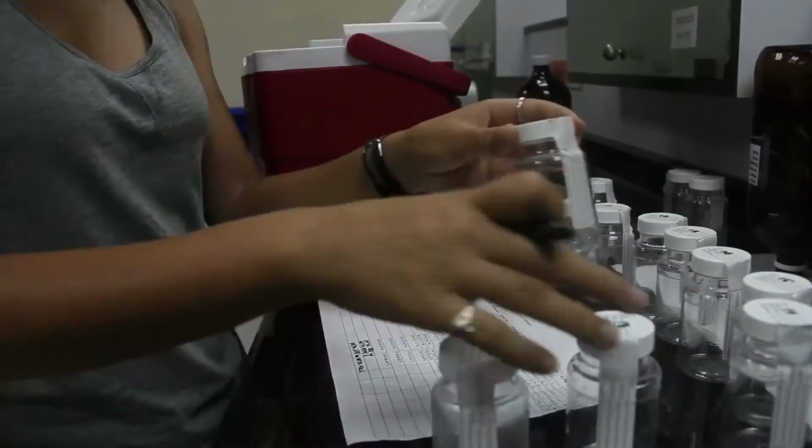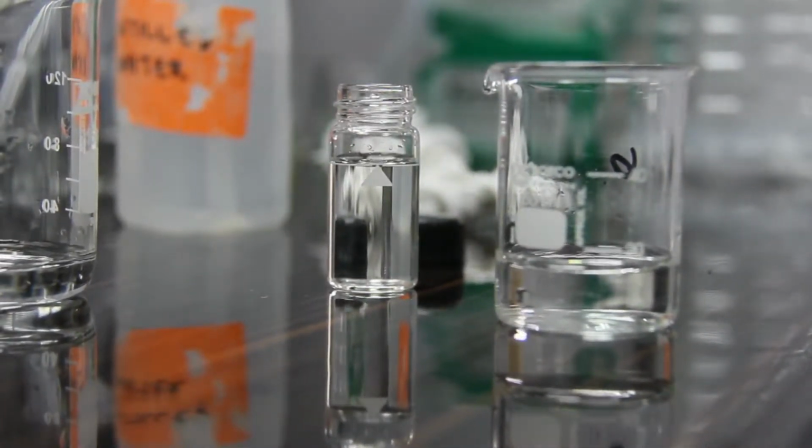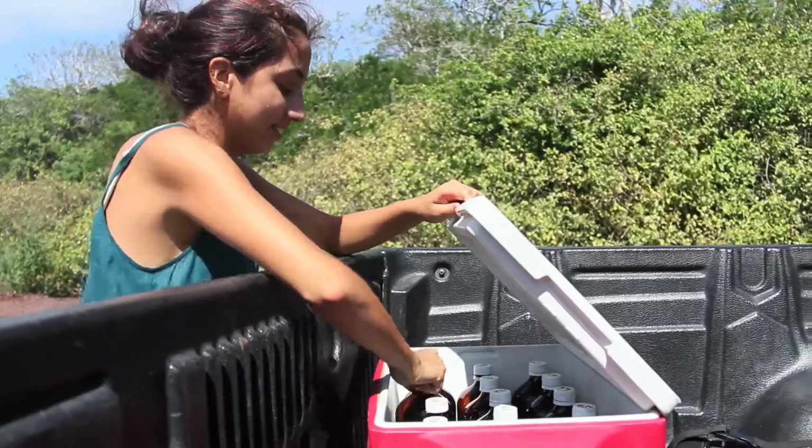What we're trying to do is have a baseline analysis of the water quality. I'm doing physical-chemical analysis, and Jill is working on the microbiological analysis. Right, so we're measuring microbes in the water that could be associated with fecal contamination. We're measuring Enterococcus, which is a standard indicator for water quality, as well as E. coli, which is associated with fecal contamination.